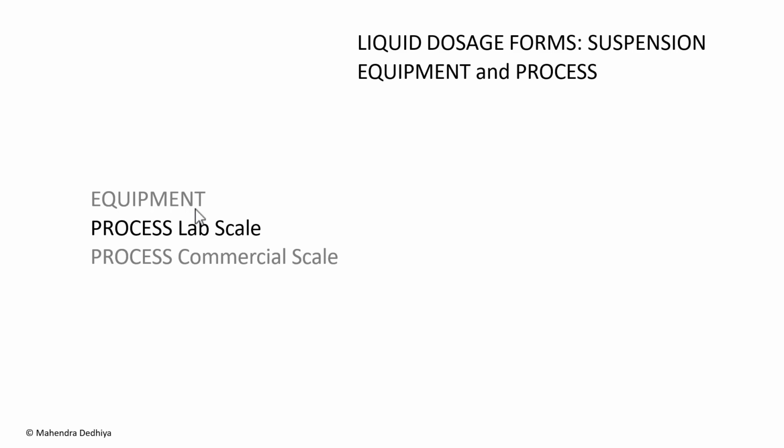To emphasize, this process is not going to be exactly similar to commercial scale processes, and many times this is the starting point of formulation. So we need to learn that. However, we should record as much information as possible so that scale up from lab scale 100 ml to pilot scale is done in a proper way.